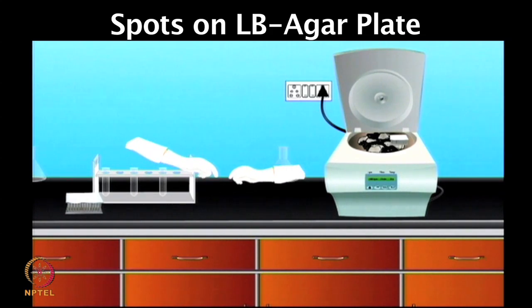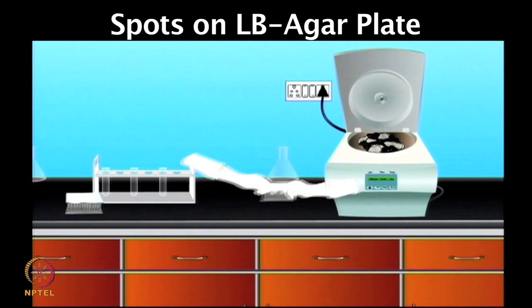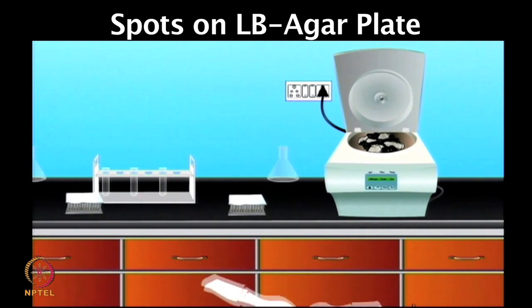Once centrifugation is complete, you need to discard the supernatant by dumping the block over a waste container.